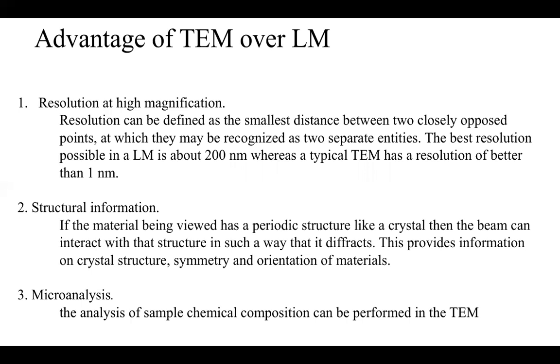And if they are very closely situated, and your wavelength of light is much bigger, let's imagine you're using a yellow light. Yellow light has a wavelength around, let's say, 400-something, 450 nanometers. Then what happens? Imagine the distance between these two particles is 50 nanometers. So when you try to image them with yellow light, the wavelength is now much bigger than the opening between the two particles.